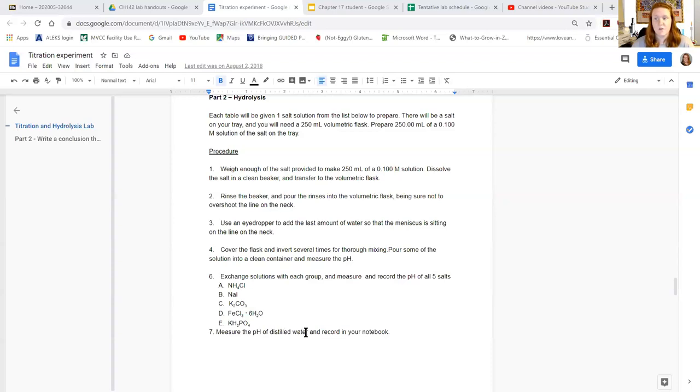And you also need to measure the pH of distilled water because one of the questions in the lab is how does the pH of the water affect it? We would expect it to be seven if it's pure water, but as per our discussions before in lecture, it's really hard to have pure water. So it's probably not exactly seven. It's definitely not exactly seven.